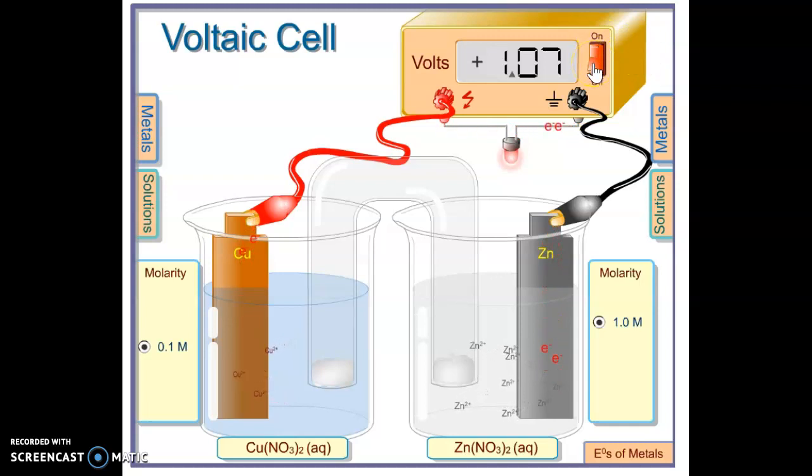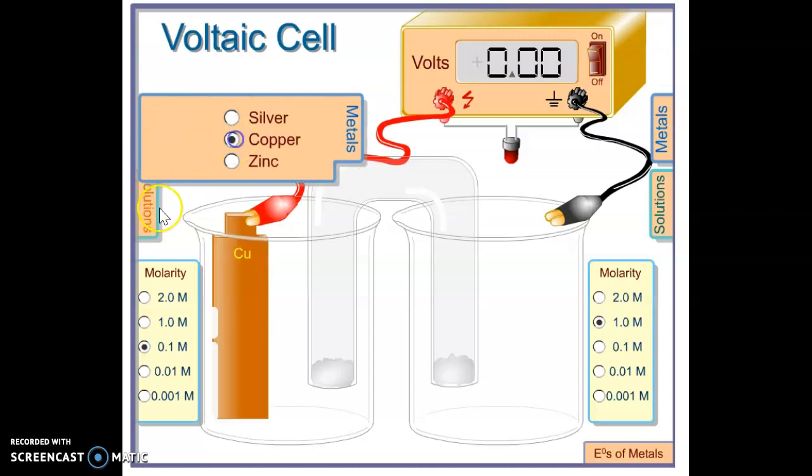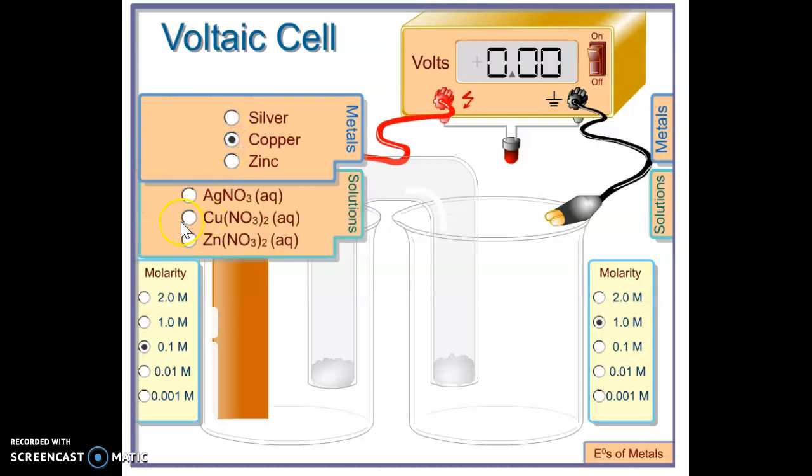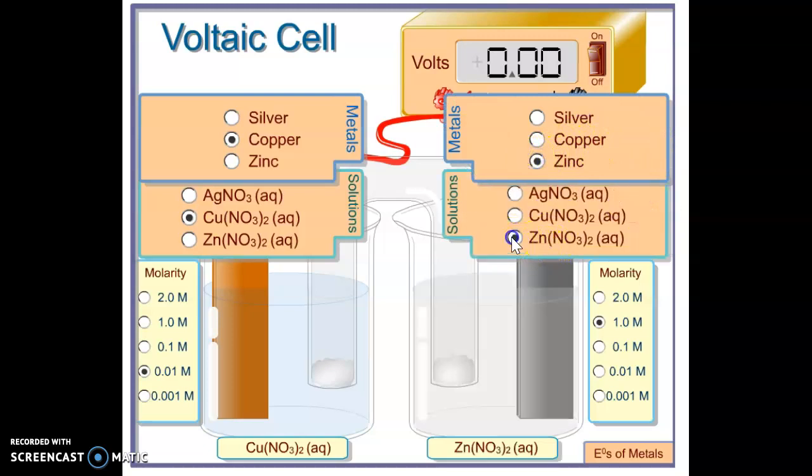Okay. Turning that off, we're going to do another one where we're just slowly decreasing the concentration. I guess it's not that slow. It's by an order of magnitude. So I know I've talked about order of magnitudes quite a lot with you all. Maybe not all of you are familiar with what it means. Order of magnitude means basically either multiplying or dividing by 10.